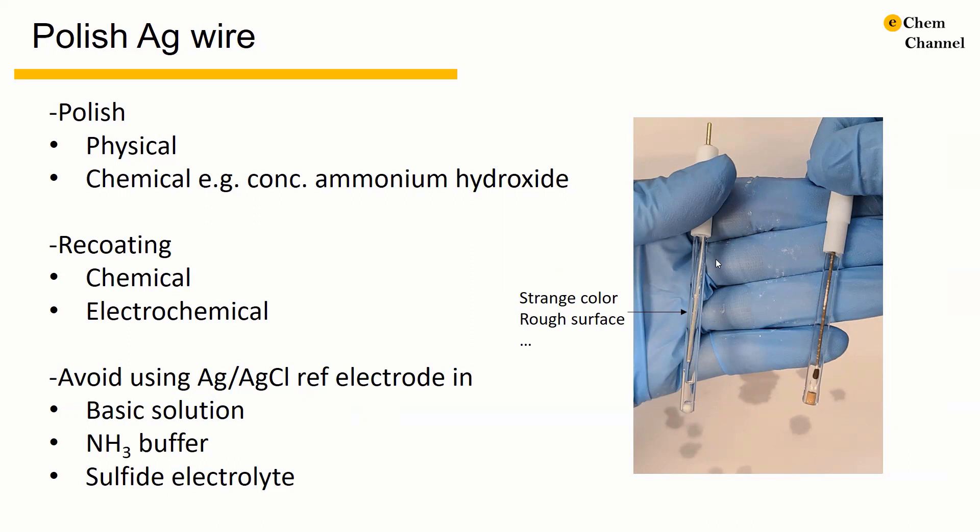Sometimes before using the silver reference electrode, you may notice that the color of the silver wire is different or the surface is not smooth. In this case, we need to polish the silver wire in order to restore a standard potential.